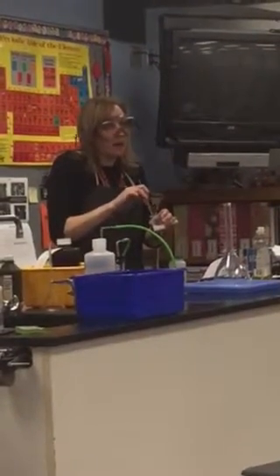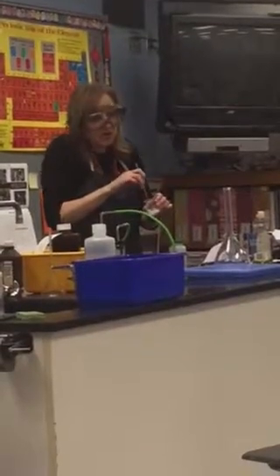Distilled water is water that doesn't have any minerals or ions in it. Normal tap water has things like iron and calcium and magnesium ions. Distilled water doesn't have any of that, so it's pure water. Add a little bit more water.